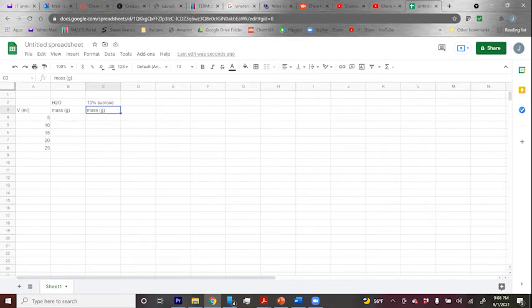So 5.20, 10.31, 15.43. Oh, damn it. 15.43.